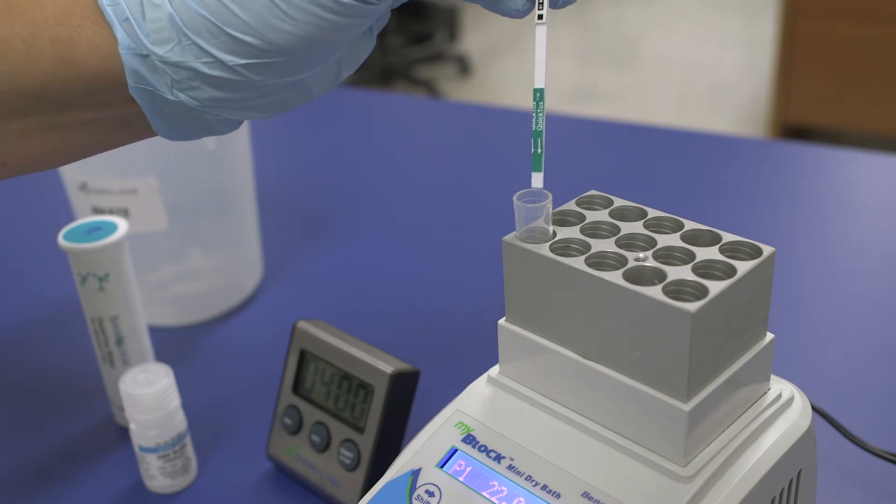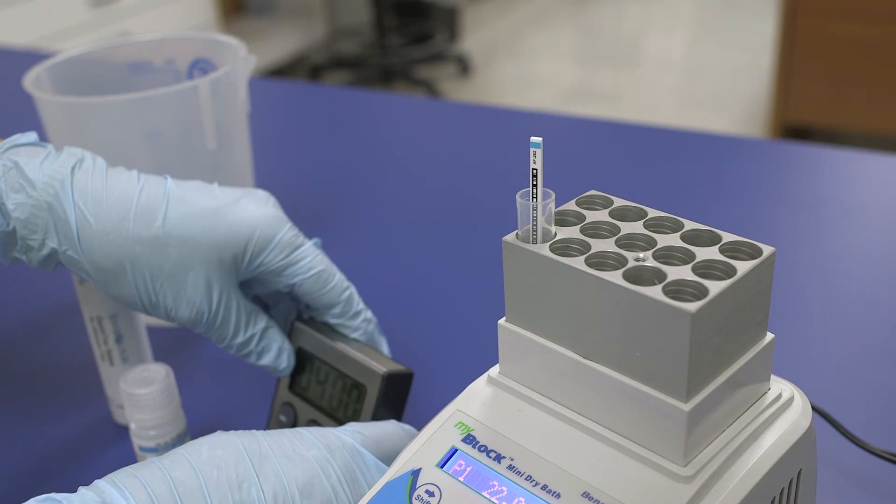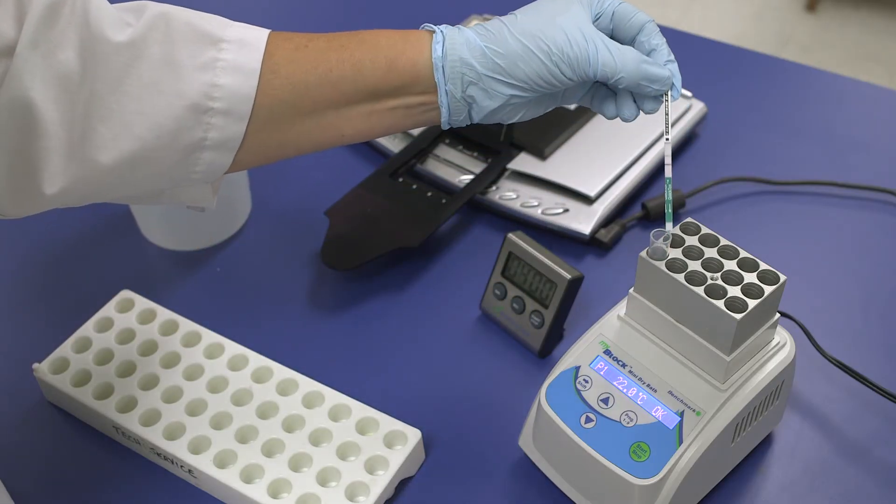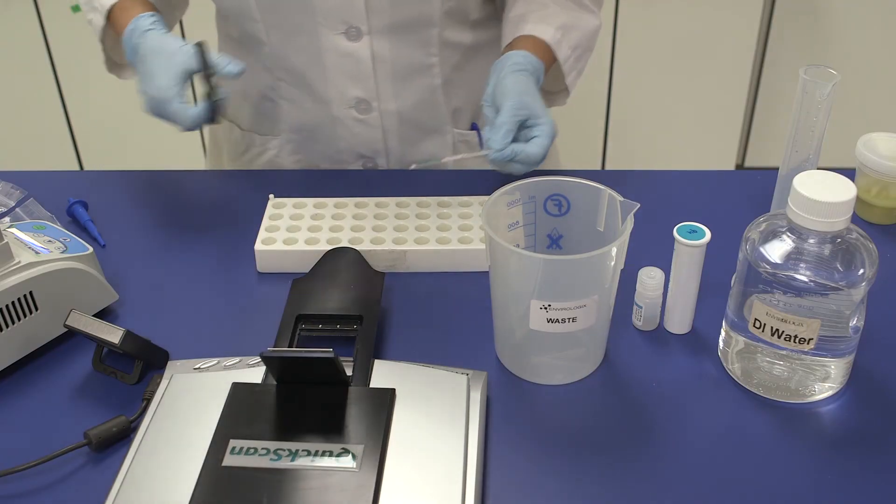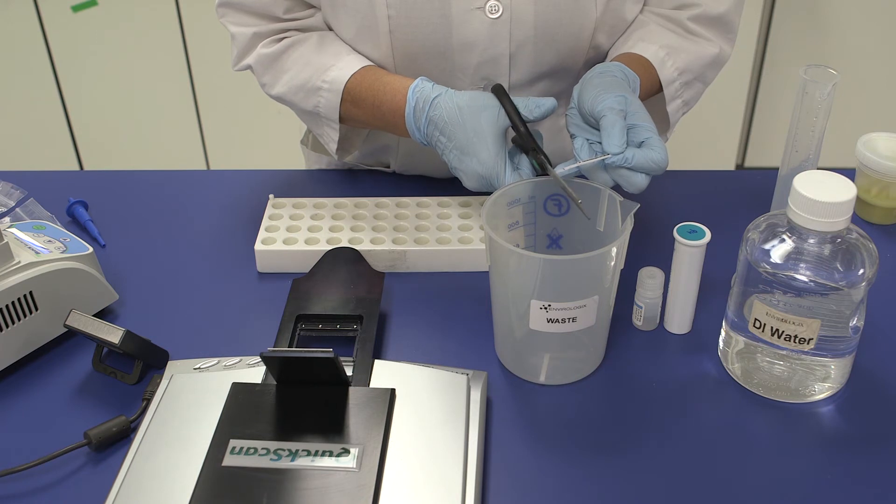Step 4. Add a new test strip and allow to react for 4 minutes. Step 5. At exactly 4 minutes, remove the test strip from the tube. Cut off the tail pad and immediately place the strip in the quick scan reader.